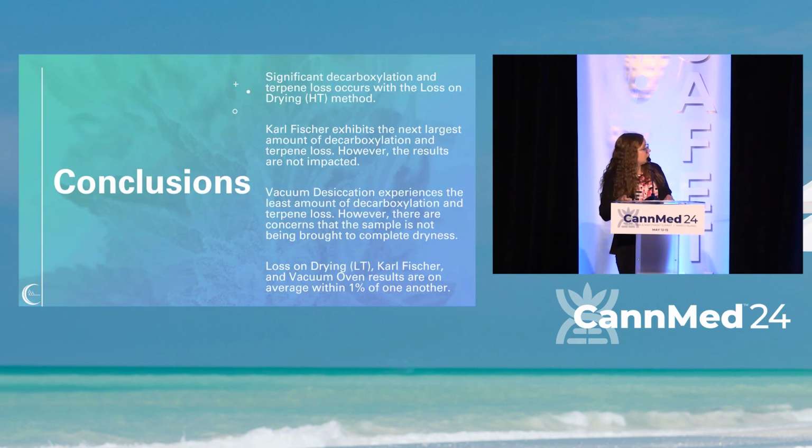So what are some of the conclusions we were able to establish from this study? First is going to be that there is significant decarboxylation and loss of terpenes with the loss on drying at high temperature method.